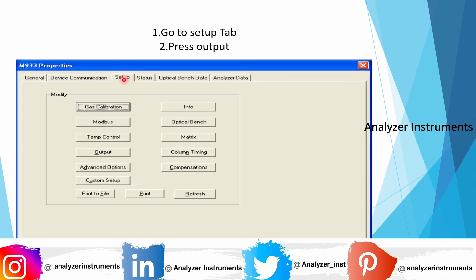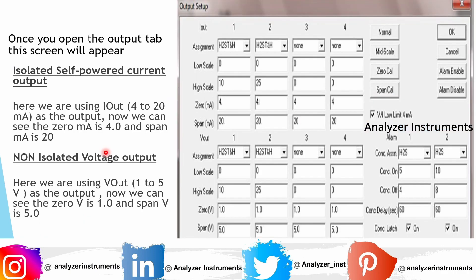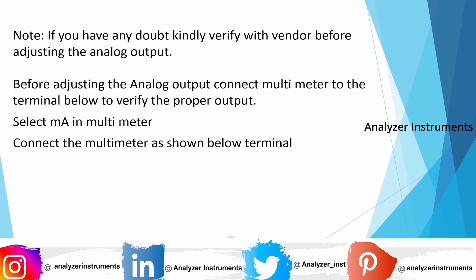Go to the Setup tab and press Output. Once you open the Output tab, the screen will appear. Under isolated self-powered current output in 4 to 20 milliamps, we have set the low scale as 0 ppm and the high scale as 10 ppm — so 0 ppm corresponds to 4 milliamps and the span (upper range value) corresponds to 20 milliamps. For voltage output, 0 corresponds to 1 volt DC and the span corresponds to 5 volt DC.